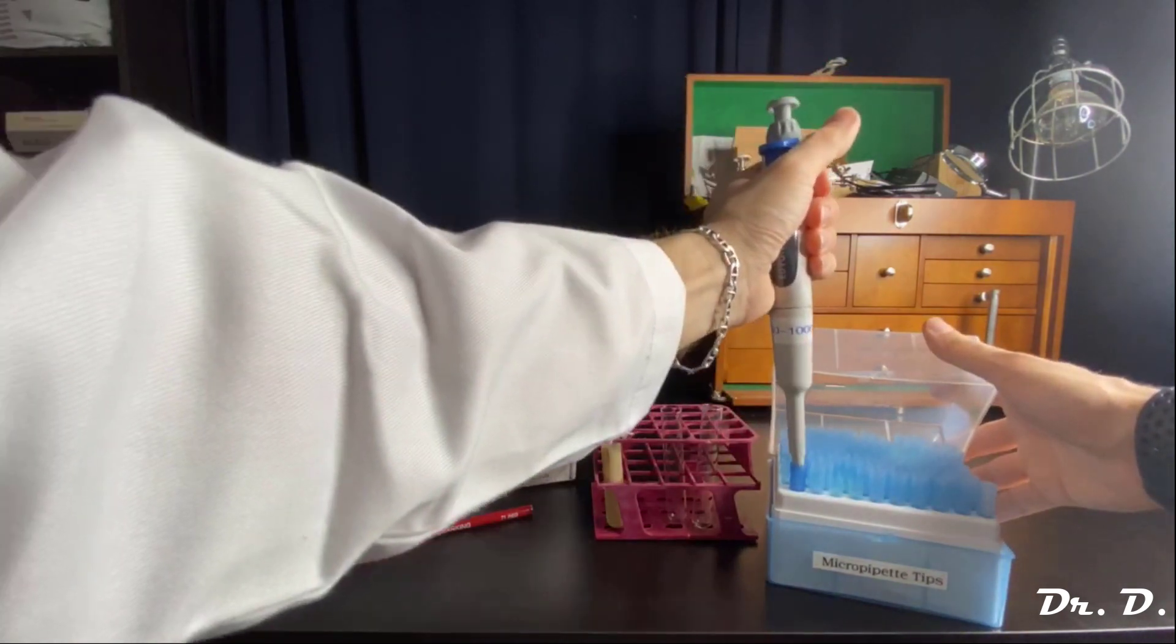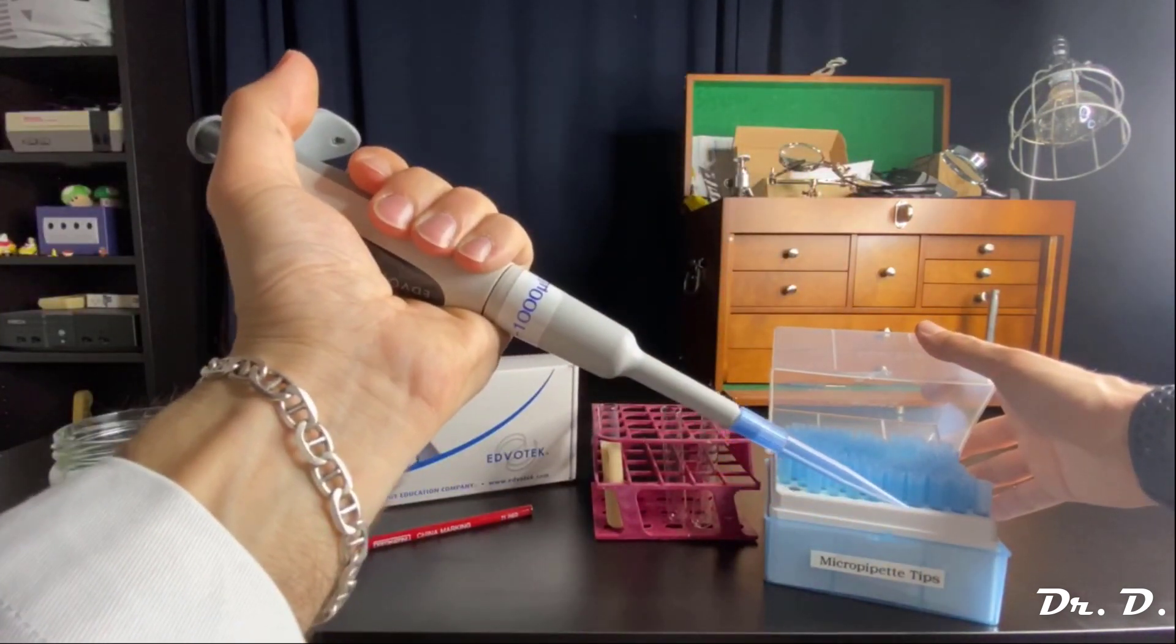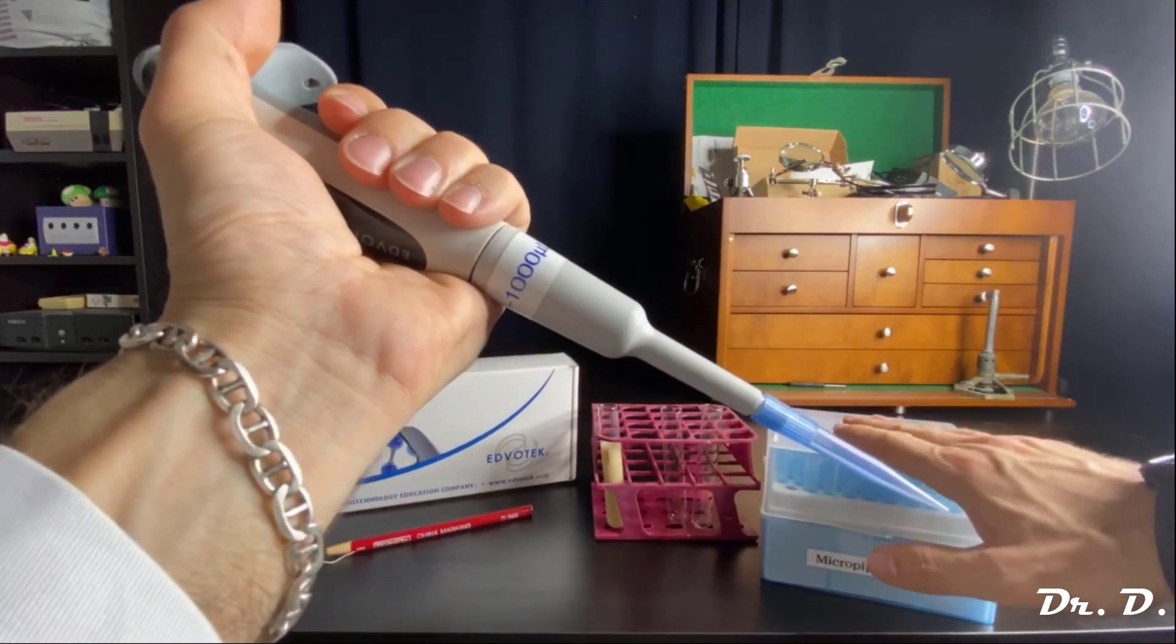Go ahead and open that up. Give it a couple taps. And there you go. There is your micropipette tip. Then go ahead and close that box.